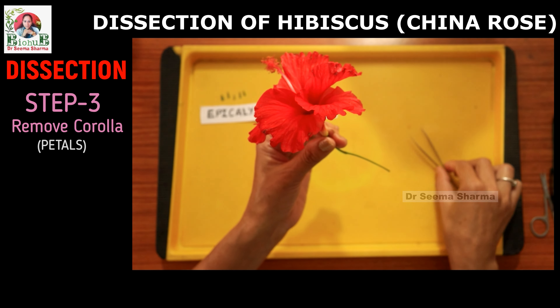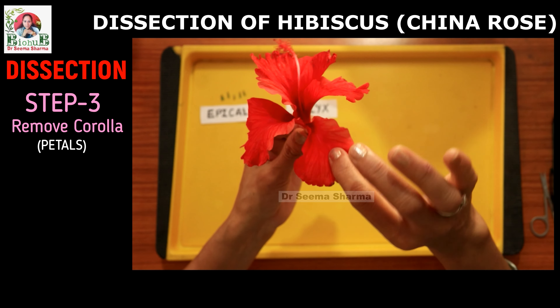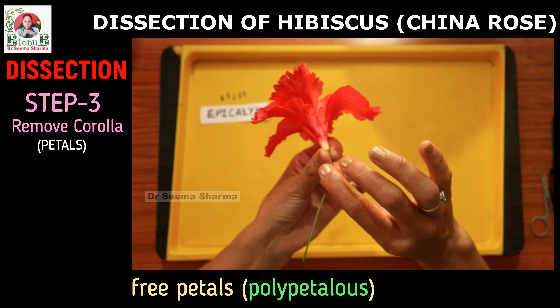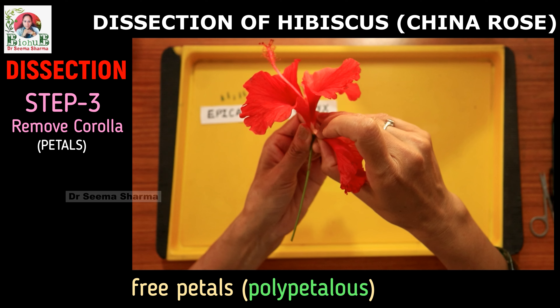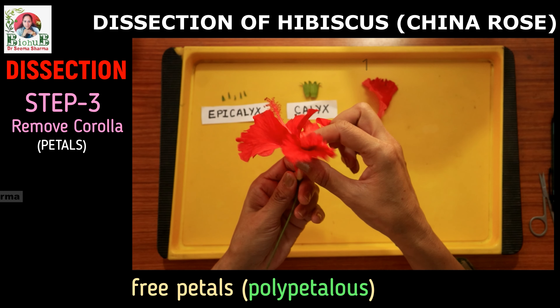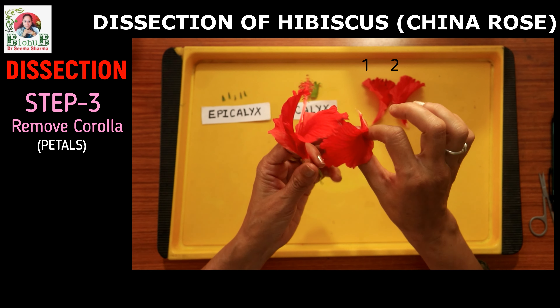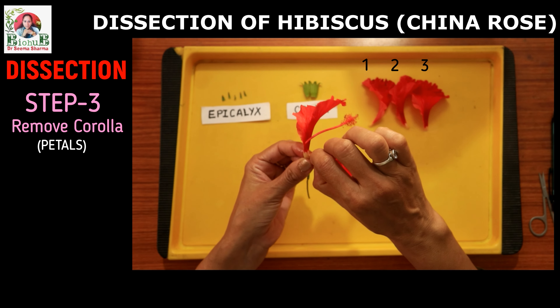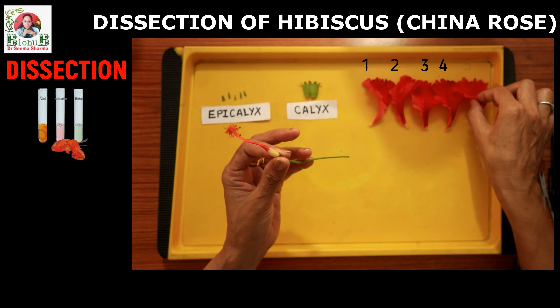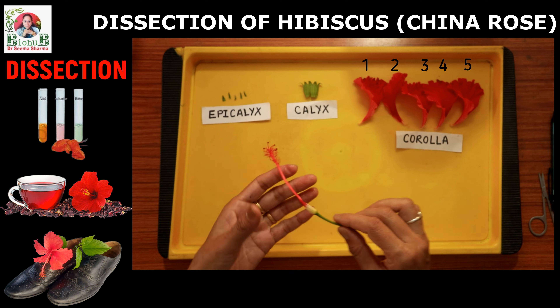Now we are going to separate the corolla, the second inner whorl. You can see it is made up of 5 red colored free petals. Let's pluck these one by one from the base and arrange them on the dissection tray aesthetically. Remember, presentation matters a lot during practical examinations, so always display all floral parts neatly and systematically. Though petals are basically meant for attracting pollinators, they are also used by human beings for the production of natural pH indicators, herbal teas, and interestingly in making black shoe polish — that's why one of its common names is shoe flower.